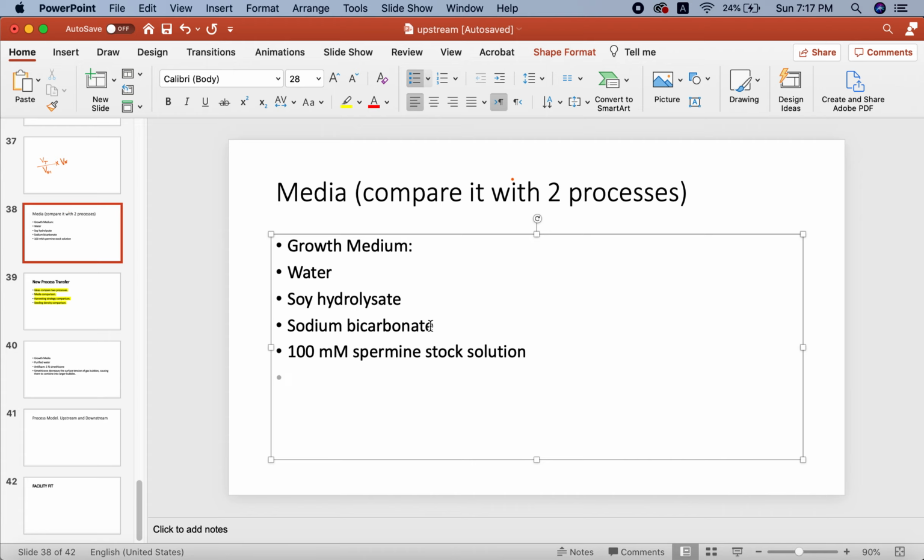Starting the perfusion on day 1 and/or increasing the perfusion rate sooner needs to be considered depending on the specific requirement of the cell line. The target seed density in production should be determined from the performance of the N-1, with the target 1 to 4 seed train split.